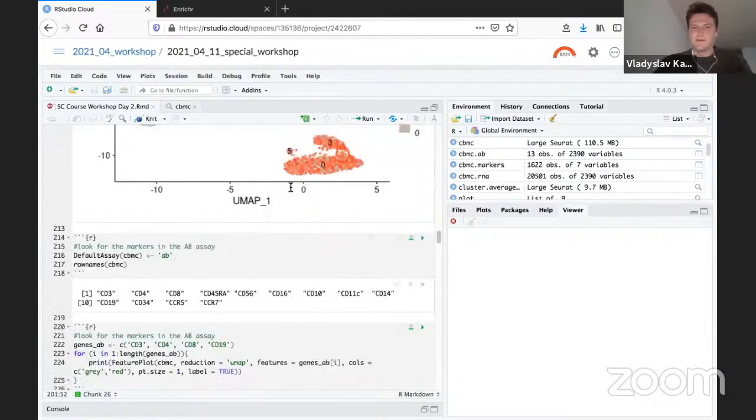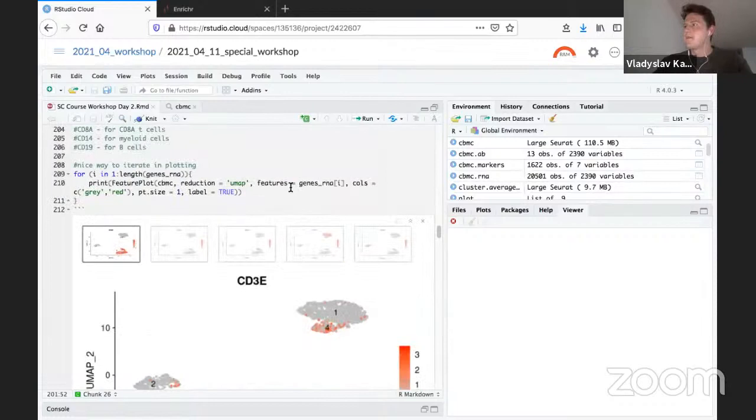Yeah, but I'm sorry, I think I wasn't clear at all. My question goes more to how, is there a tool or a database where I can cross-reference my genes and then have the information of which of those genes are known to be expressed?